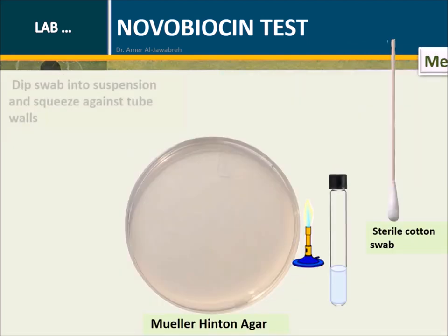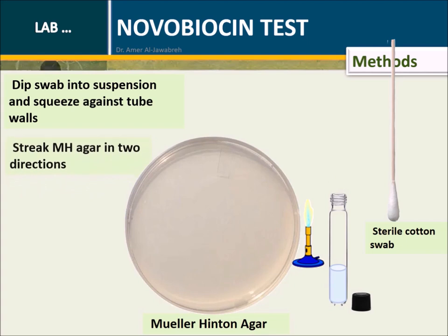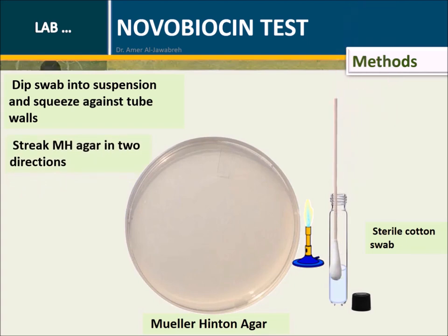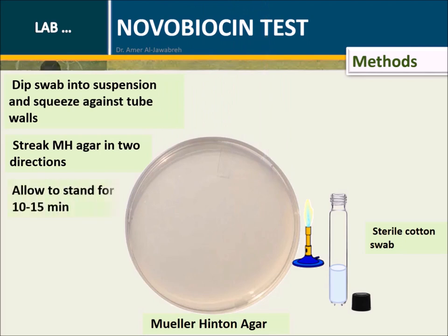Methods: Dip swab into suspension and squeeze against tube walls. Streak Mueller-Hinton agar in two directions. Allow to stand for 10 to 15 minutes.